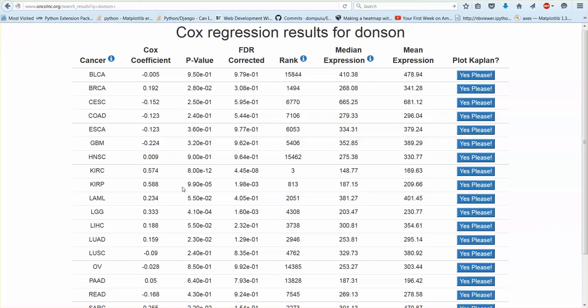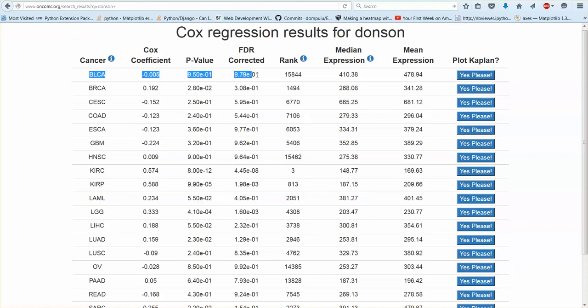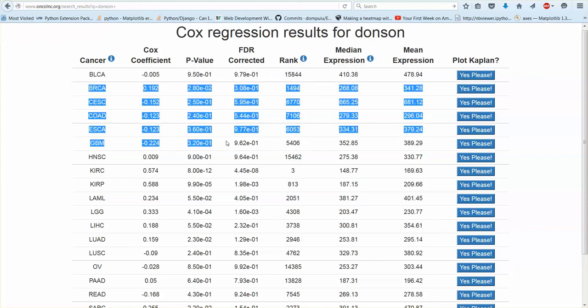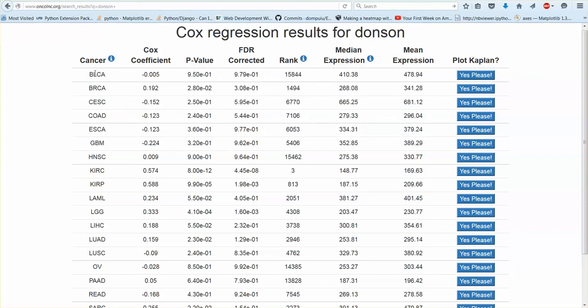And then you'll get the p-value for the analysis and then FDR corrected p-value, and the FDR correction is performed per row. So it's only for the genes that were analyzed in this cancer. So the FDR correction has nothing to do with genes that were analyzed here. Only the per row FDR correction.